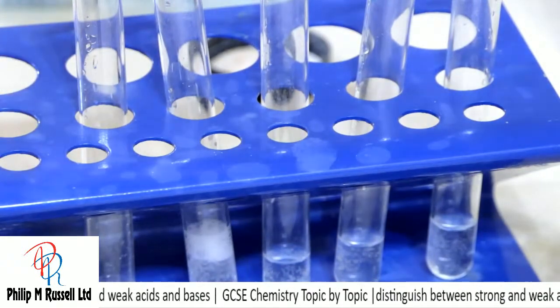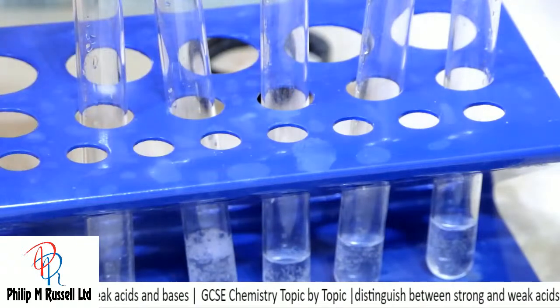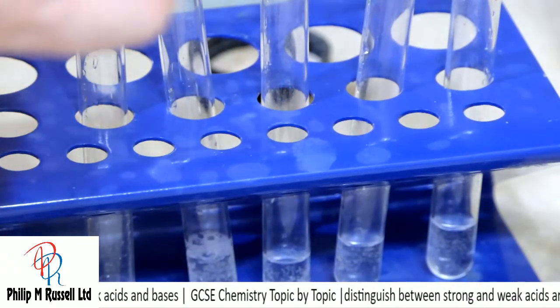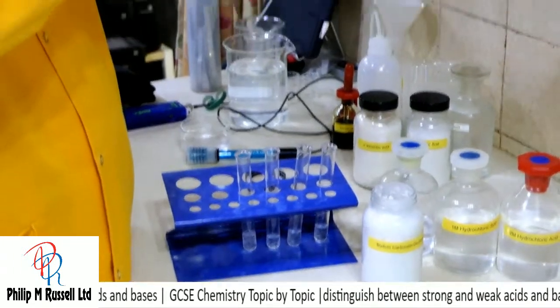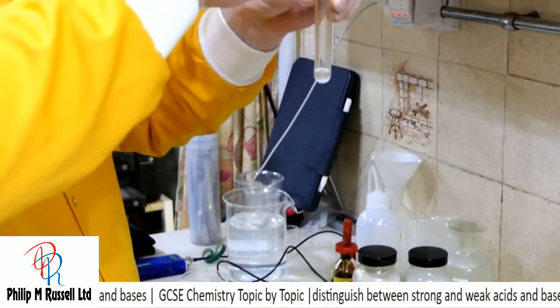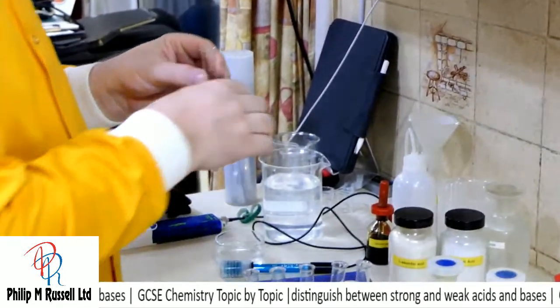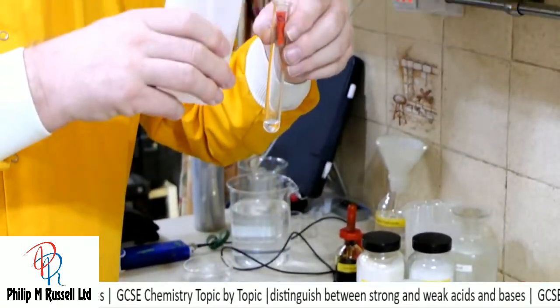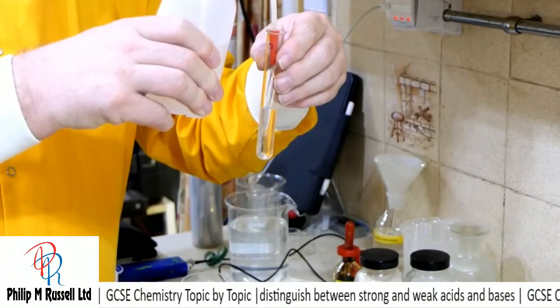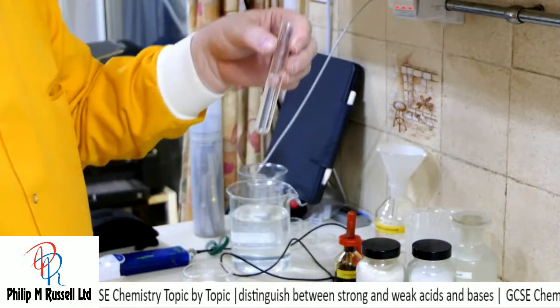So I've now got a little bit in here, and what I could do is I could dilute this. Now I've got a bit too much, so I'm just going to get rid of a little bit of this. That's ideal. And what I'm going to do is dilute this about tenfold, only approximately.